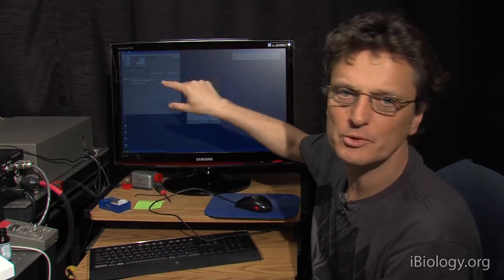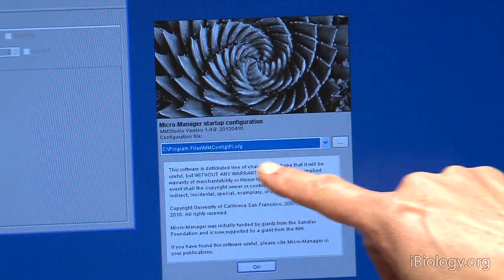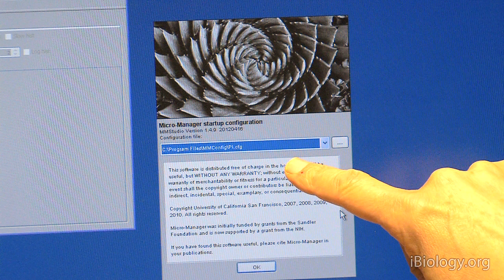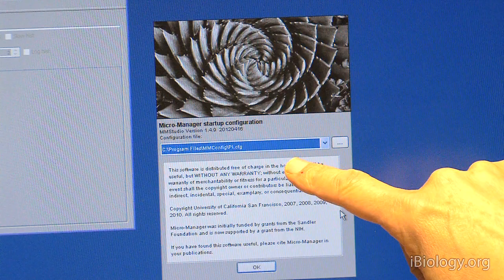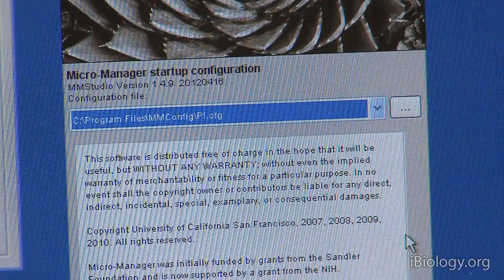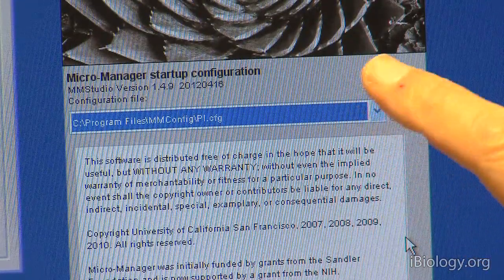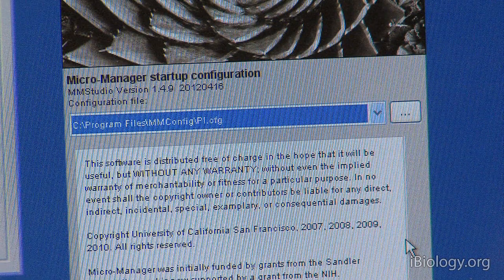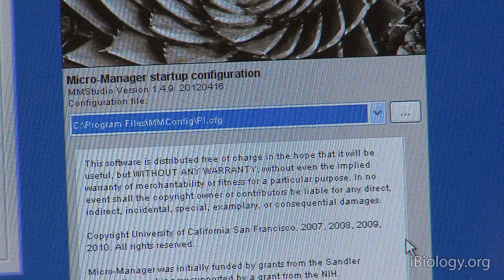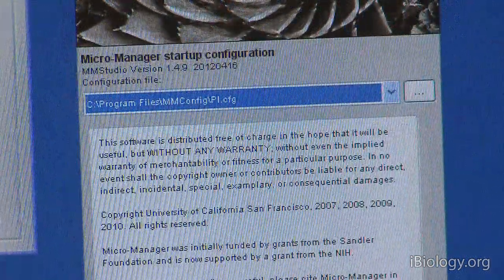However, all the principles of what's going on here is directly applicable to other software packages as well. So, first of all, we need to load a configuration file. And this is a file that tells the software what hardware is connected to the system. And so I've set that up in advance. And in this case we have a Zeiss microscope and an old Princeton Instruments camera. And that's about it.